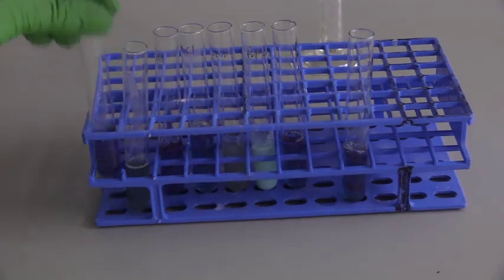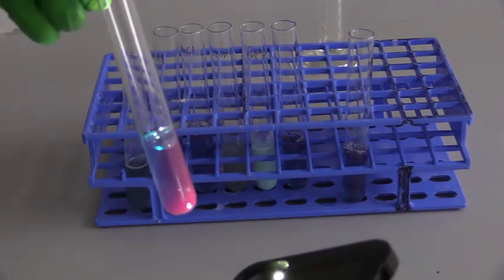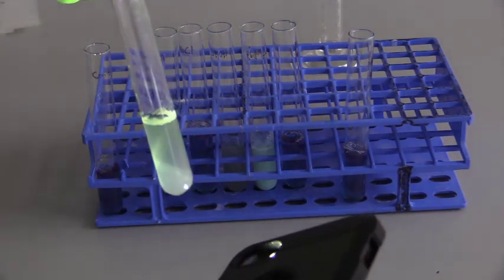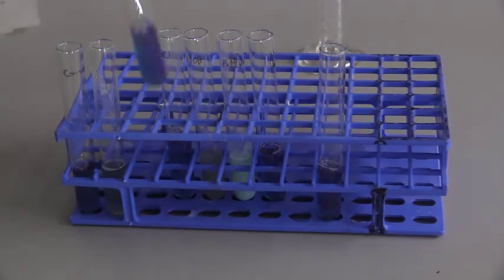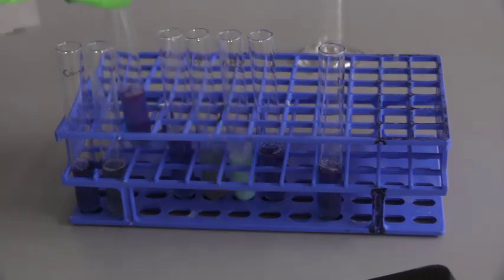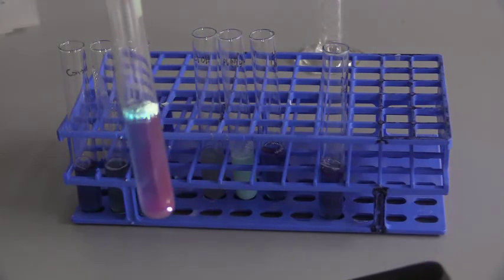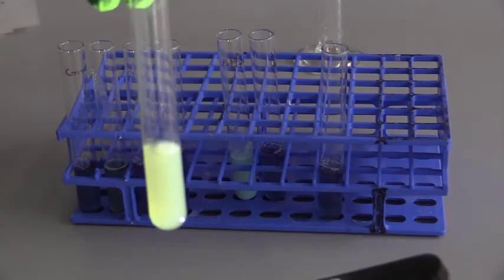Okay, so just a quick review. This is the control where we did nothing but diluted it with phosphate buffer. This is the hot sample that was heated and then cooled. This sample was cooled on ice and then warmed a little bit to room temperature. This is the sodium chloride. This is what happens with ethanol.